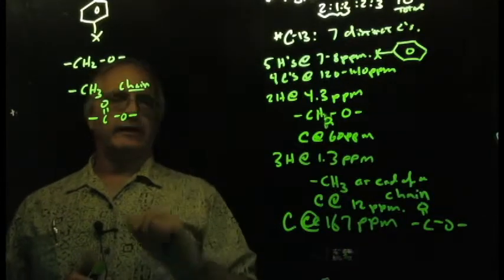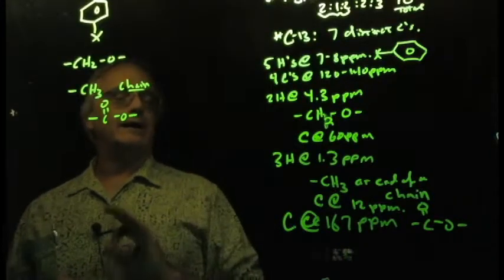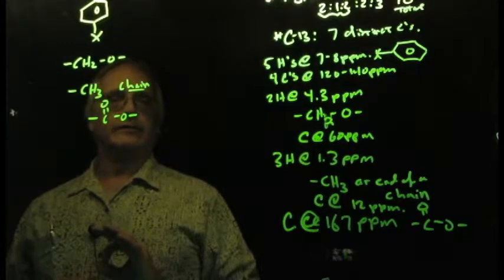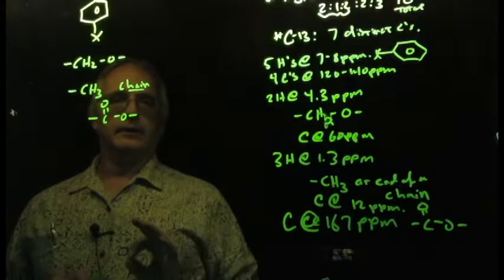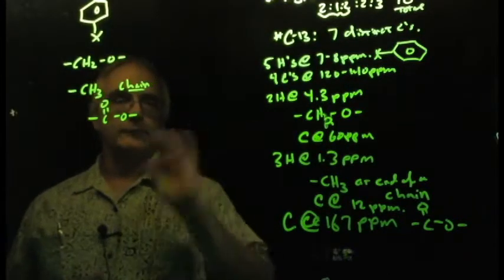What I'm going to do is apply the magic eraser, and I'm going to move on to the other big unknown in this Friday assignment, and that is the research lab unknown. So let me apply the magic eraser and be right back. And now the unknown from one of the research groups. I like using these from time to time simply to give a feel for how NMR is used here in the research labs to solve sometimes simple and sometimes more complex problems that the various research groups encounter.